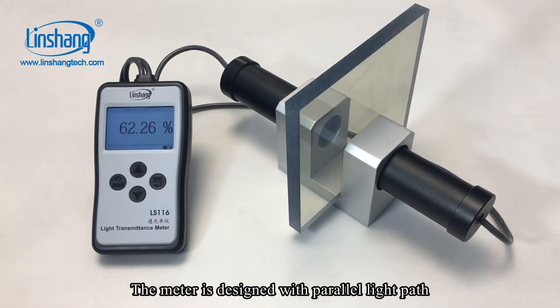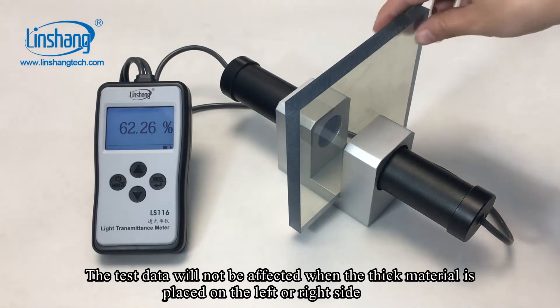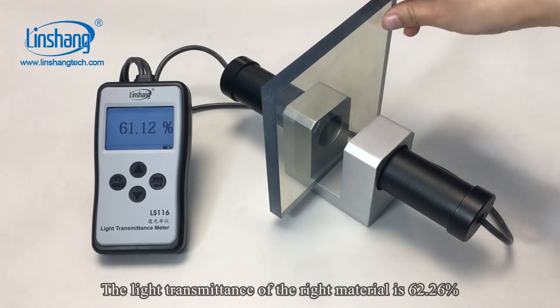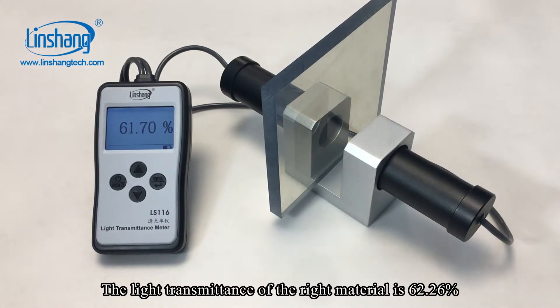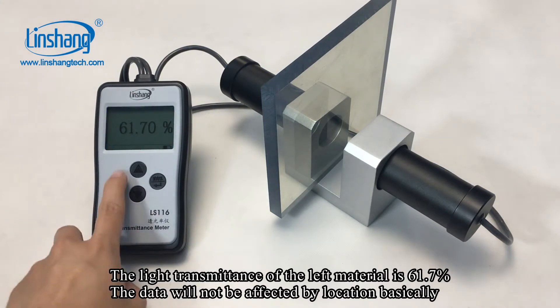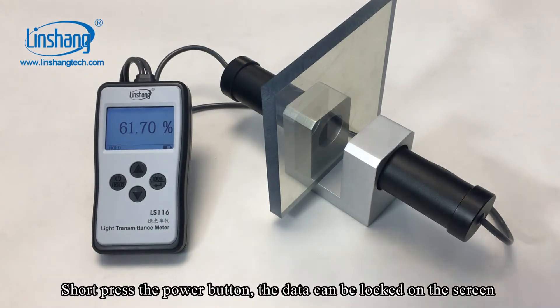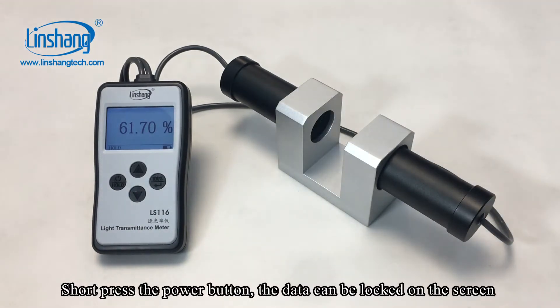The meter is designed with parallel light paths, so the test data will not be affected when the thick material is placed on the left or right. The light transmittance of the right material is 62.26%, and the light transmittance of the left material is 61.7%. Short press the power button and the data can be locked on the screen.